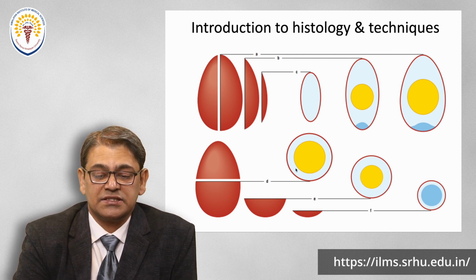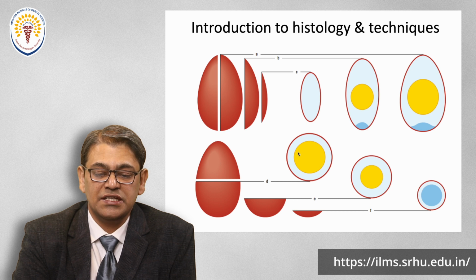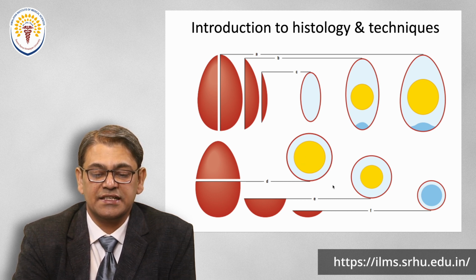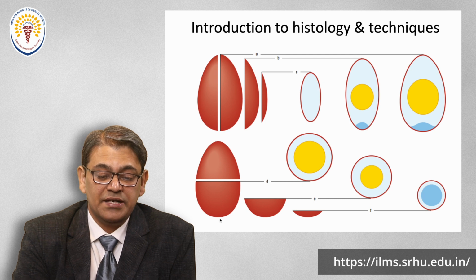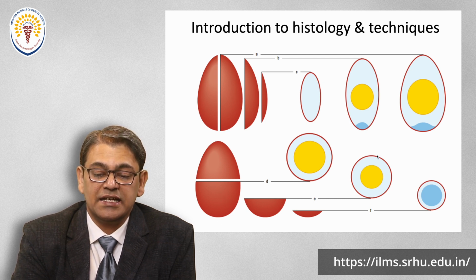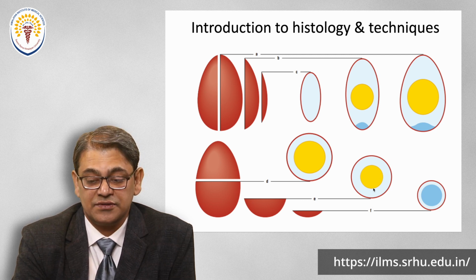Now in the lower part of the slide, you see there is D, E, and F. The D1 is the horizontal section. You see another dimension of the same egg structure. It is rounded outside, and you see the maximum width, with the yellow area present centrally. But if you go slightly below the midpoint, then again the periphery is reduced and the central yellow structure is also reduced.